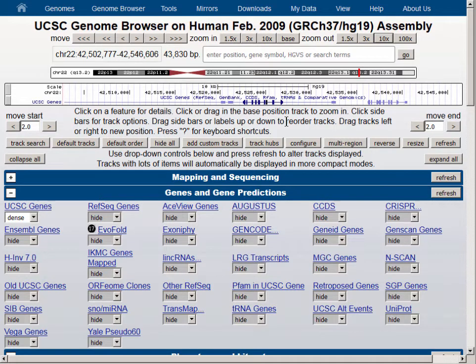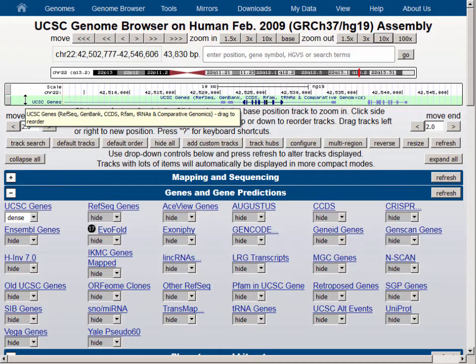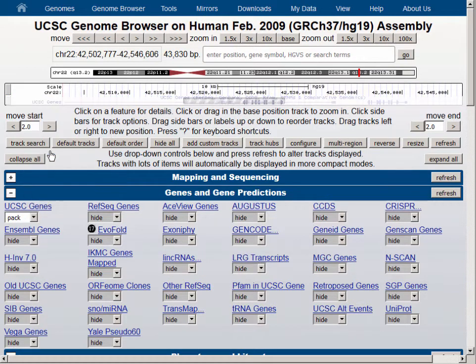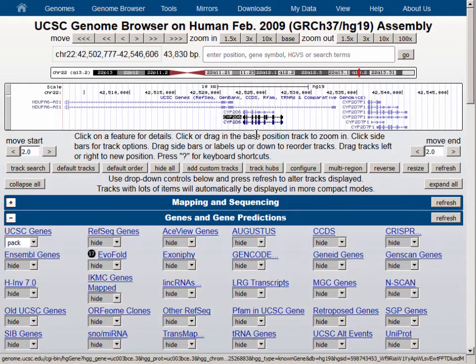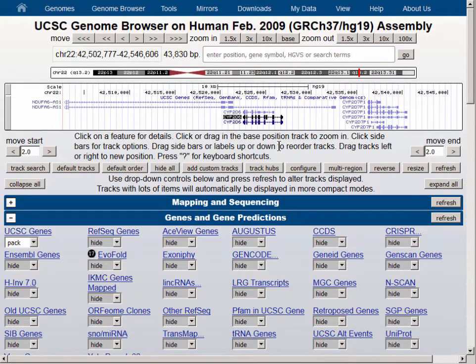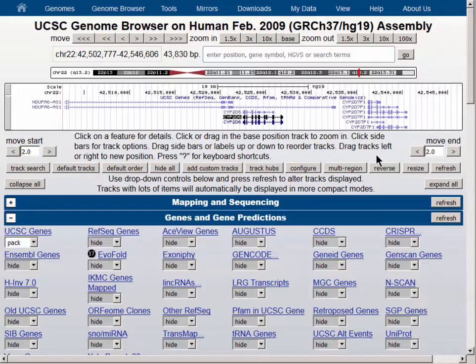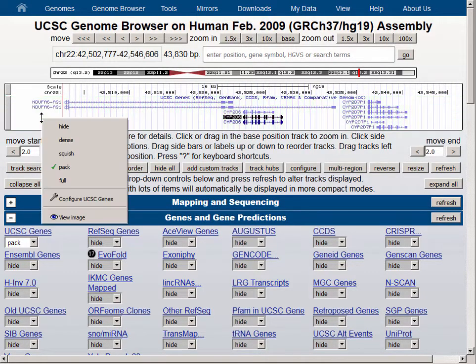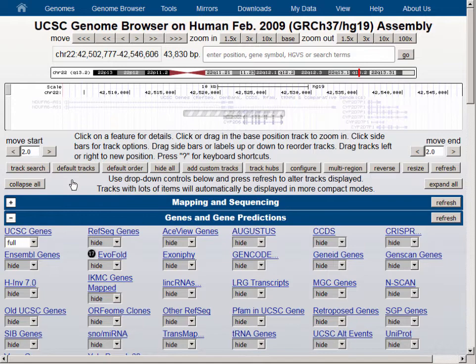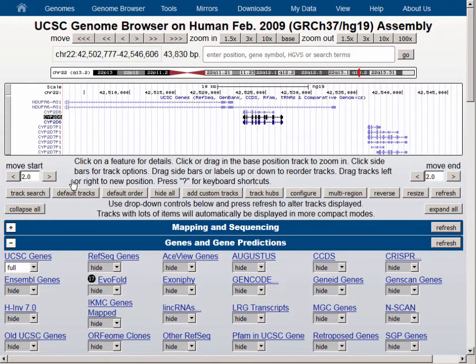If we go back to Pack visibility, we can see that the multiple isoforms of the CYP2D6 gene are shown, as are multiple isoforms of the nearby genes. Let's switch the visibility now to Full, and we can see that in Full, each individual isoform of each gene gets a separate row, and the genes are no longer packed tightly into the browser display. Full display mode takes up much more vertical screen real estate than Pack.